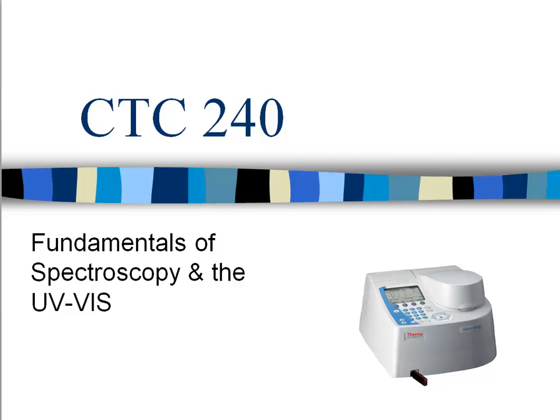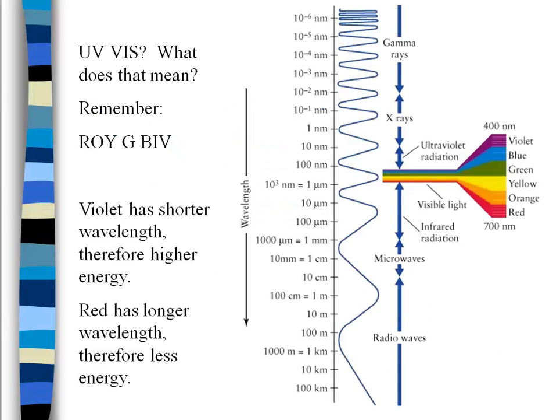If you want to take a look at an electromagnetic spectrum, you can do that. Here's a representation of that spectrum. So again, we get this ROY G. BIV that happens here. Violet, of course, is higher energy than the red. And ultraviolet is even worse. I want to stay away from those beams. And then X-rays happen above that, so I want to stay away from X-rays and minimize my exposure from it. And then above that is, of course, gamma rays. And gamma rays are the rays that I definitely want to stay away from because of the high energy and wallop that they can bring.